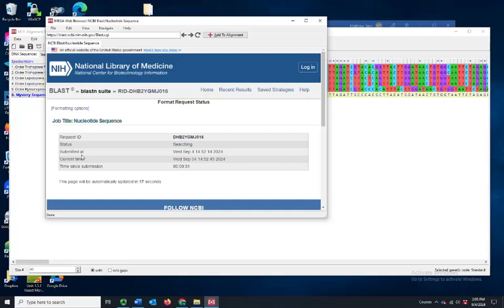So it's nearly done. I'm going to let it refresh one more time. It refreshes automatically. It just waits a little longer for each successive refresh. So let's wait for one more refresh. There we go. And if at any point this stops refreshing, you can just reload that page yourself, and if it's done, it will pop up. Okay, it is in the afternoon here where I'm doing this, so let's see if it will work after this one more. It usually doesn't take more than a minute, minute and a half. Okay, we'll let that go and we'll come back to it.